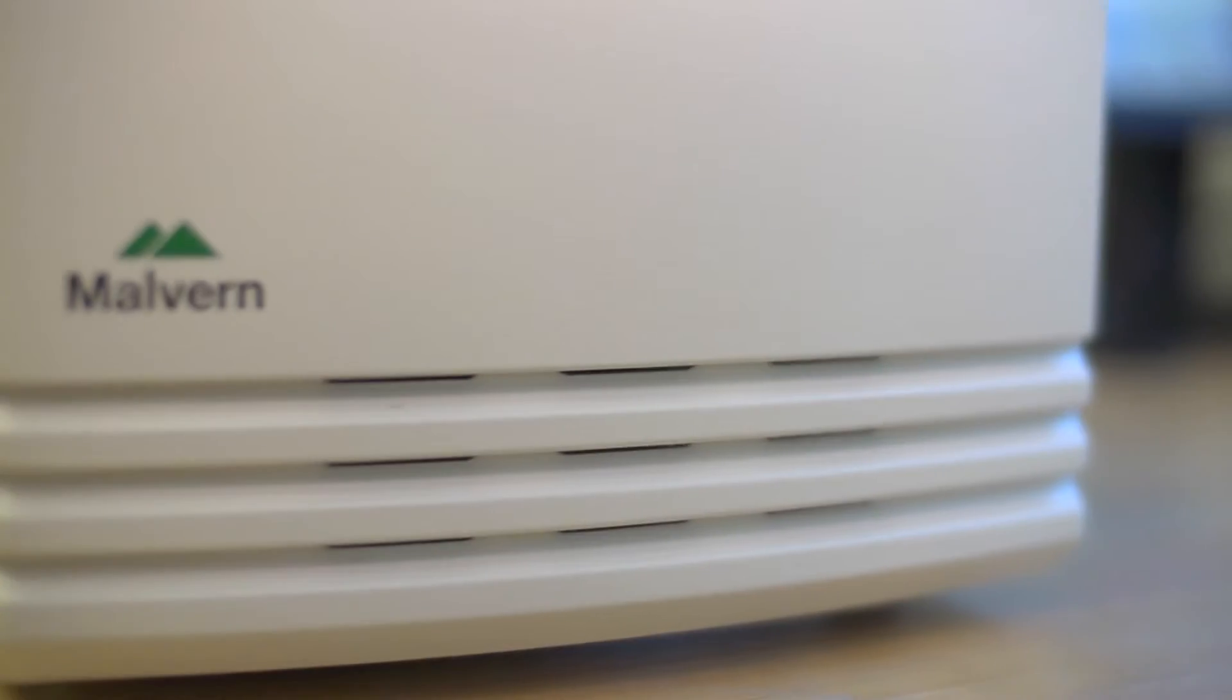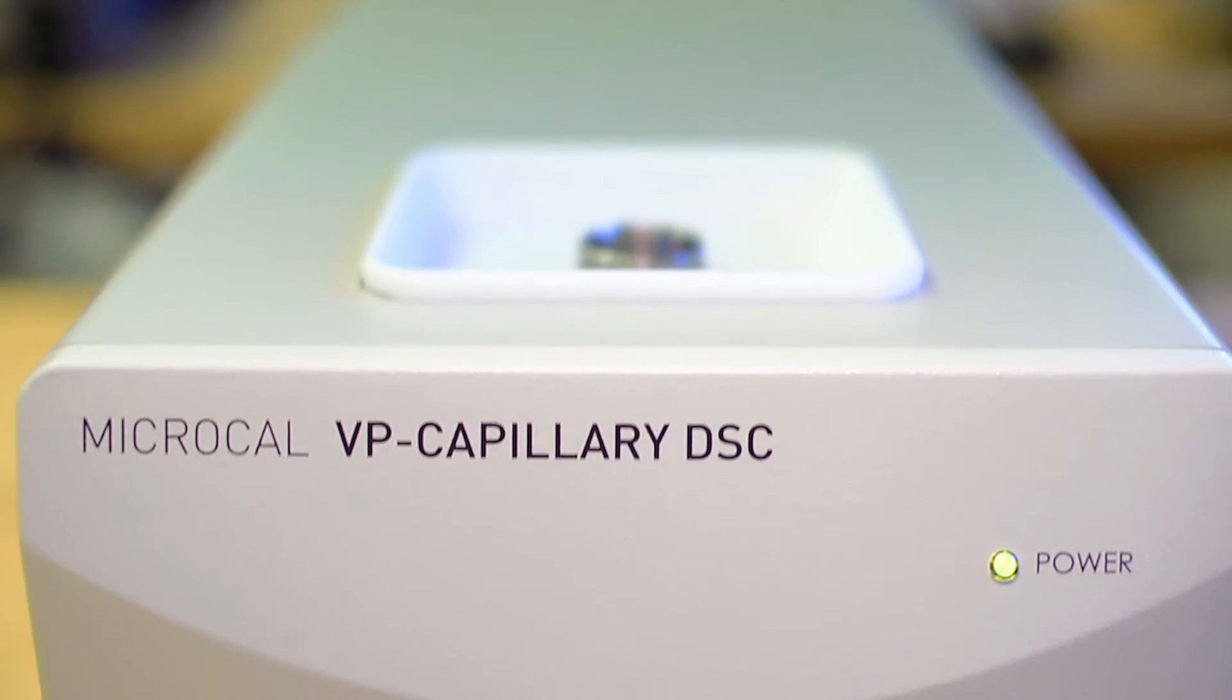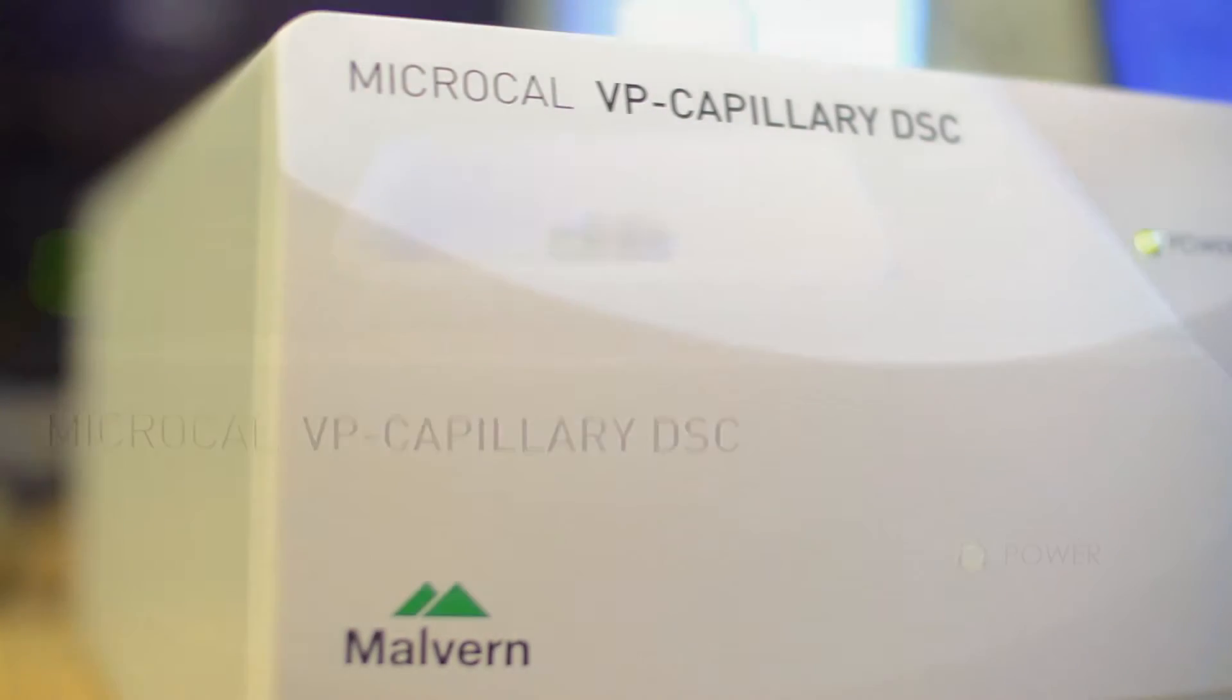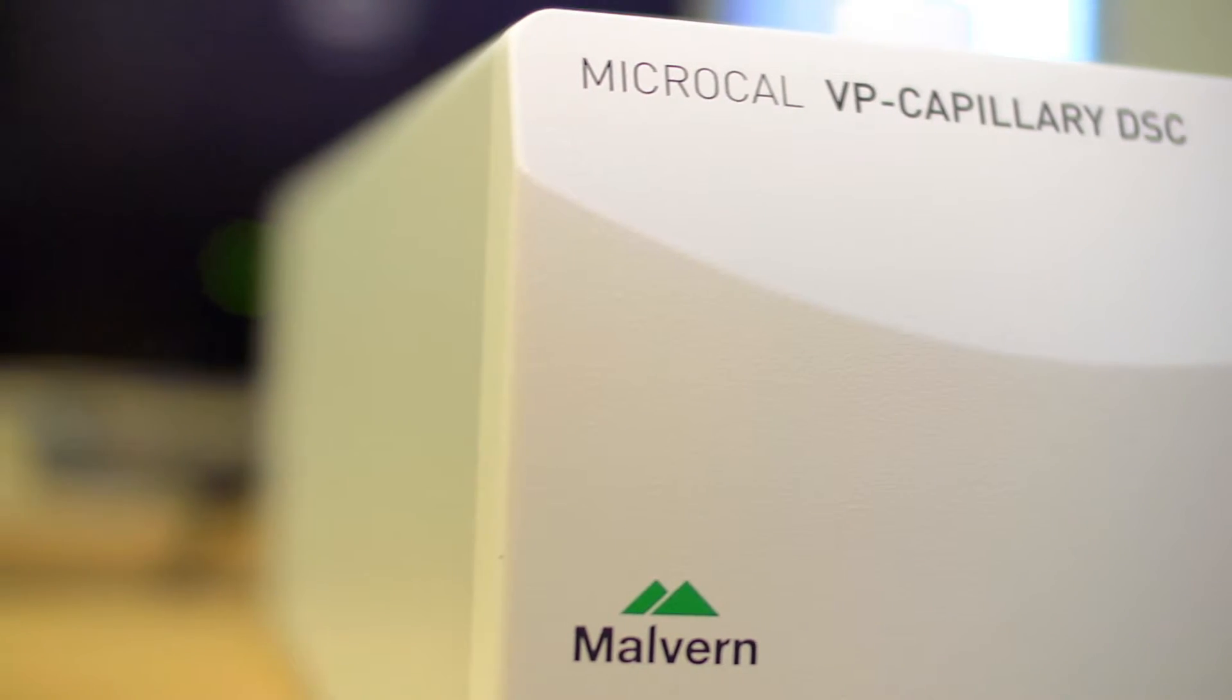The manual MicroCal VP Capillary DSC delivers the ability to study molecules in their native state without labeling and can be used with colored solutions or turbid suspensions, measuring tight binding constants of up to 10^20 M^-1.